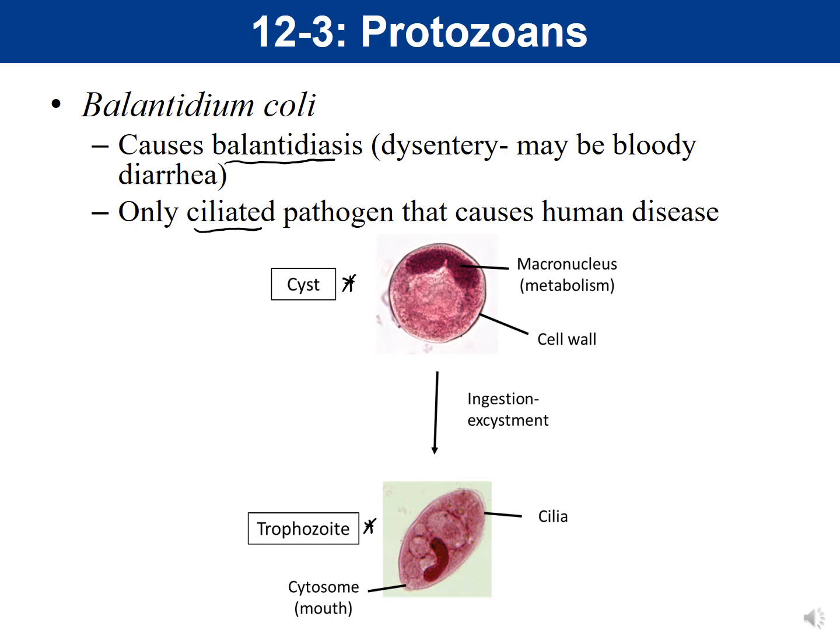And what you're looking for in this is a kidney-shaped nuclei. So we have this kind of kidney-shaped nuclei, and the cyst tends to be more circular, whereas the troph still has that nucleus. You can see it darker stained here.